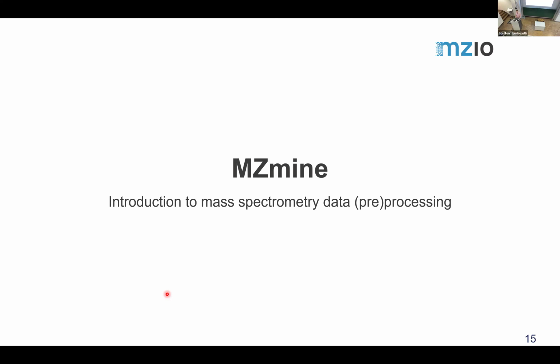Okay, I hope that you in the end see some advantages of MZmine. Maybe XCMS or MS-Dial is the better tool for you. Maybe, do you do a lot of data independent analysis if you use MS-Dial? Yes and no. Probably for data independent, we have some tools in MZmine, but maybe MS-Dial might still be the better tool.